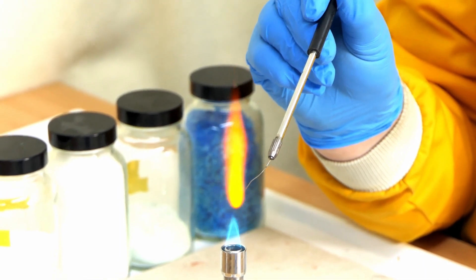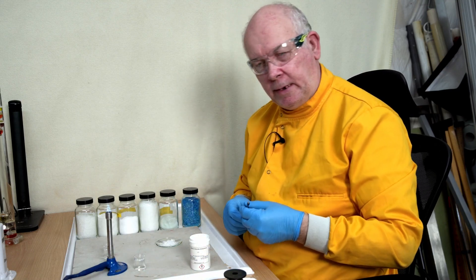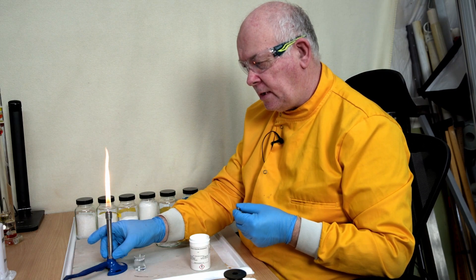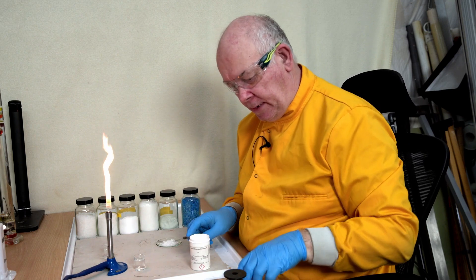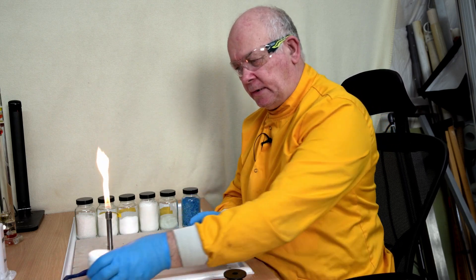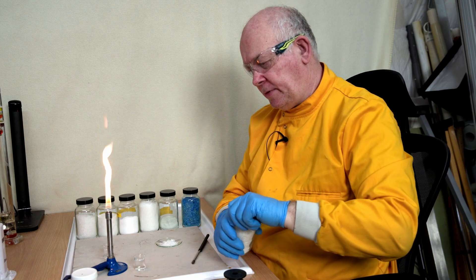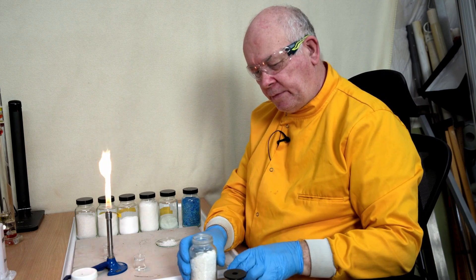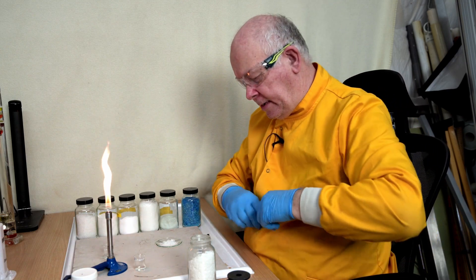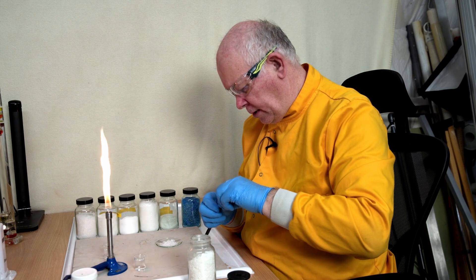What do you think? Could it be that one? Well, there are other substances that it could be, so let's try looking at a few of those. I think a good contender is lithium, but I know of another substance that burns with a reddish flame, and this is calcium. So let's compare calcium here. I'm going to load up a new piece of wire.